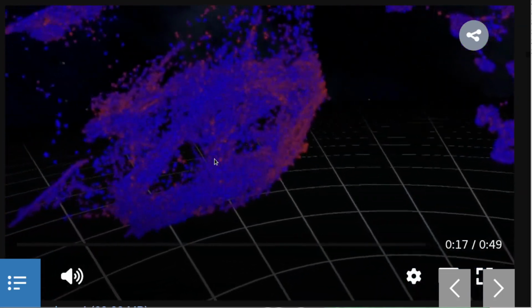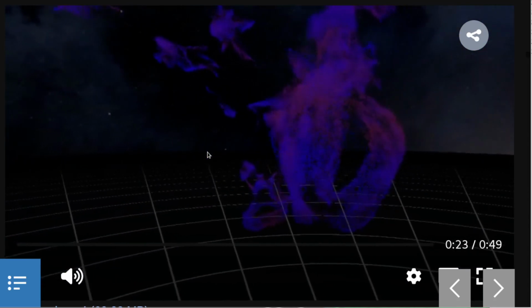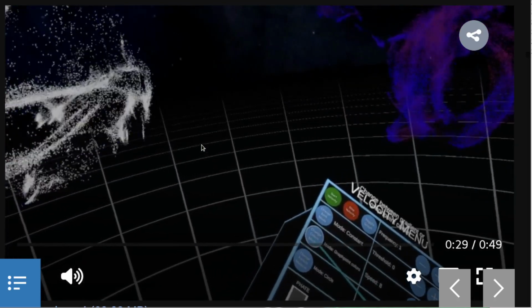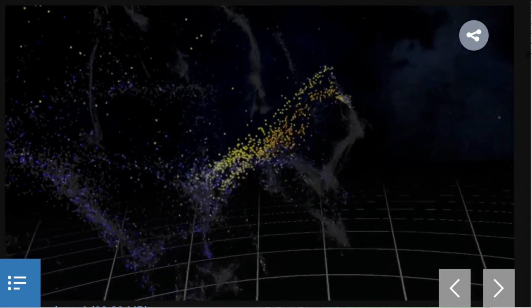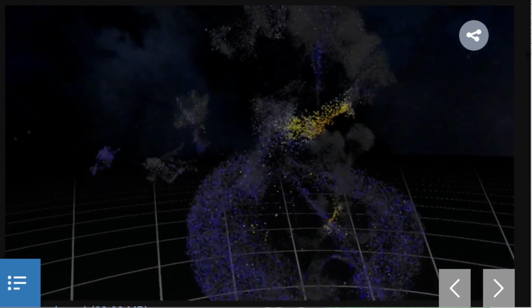Video S4. Visualizing RNA velocity in CellexalVR, related to Figure 1C. Each cell emits an arrow that travels the length of the calculated vector. The longer the trajectory, the redder the arrow. Arrows can be changed to small particles for easier viewing on dense plots, and both emission types can be colored by gene expression or cell attribute. Data from the liver cell atlas reference in the main text.